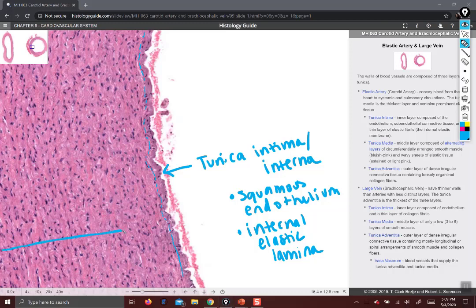This layer here is the tunica media, and it consists of smooth muscle and elastic fibers. The tunica intima is relatively thin, but in arteries the tunica media is quite thick and robust. That's one of the reasons why arteries tend to have rounder shapes — they have a thick wall to maintain their shape.